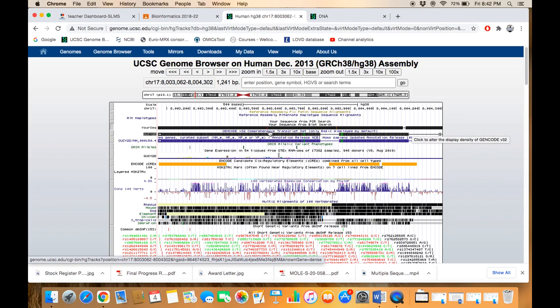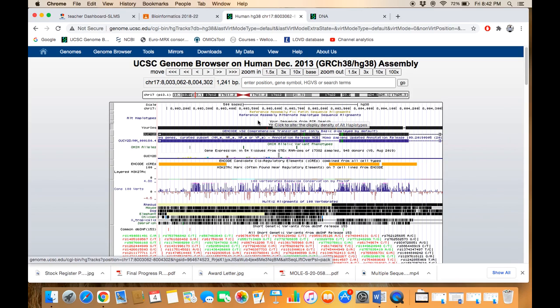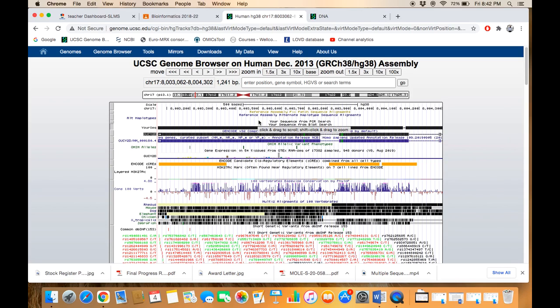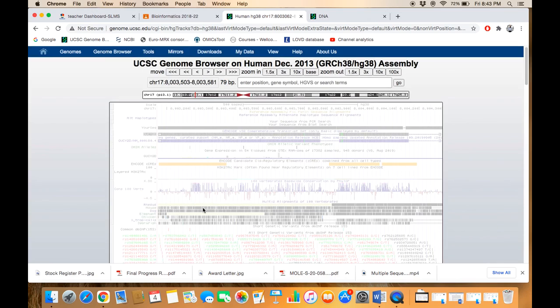If you further want to look at what kind of variation this is, you need to zoom this region. For zooming, you need to press the Shift button, select and drag, and click on 'Zoom In.'